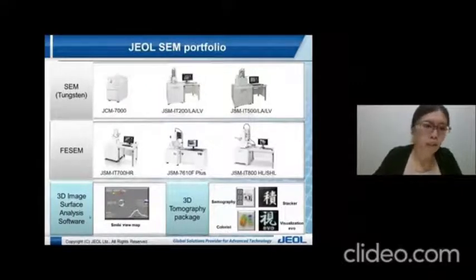In addition, we can perform 3D surface analysis using SMILE VIEW Map. Also, we provide 3D tomography solutions. Four software packages work together to reconstruct for the 3D SEM.